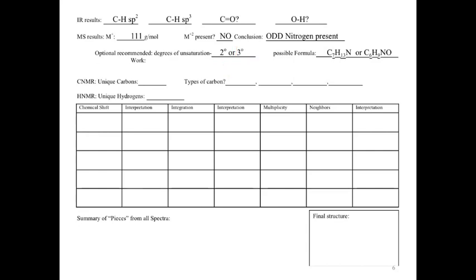So hopefully we're still following along. You'll notice we're 19 minutes into this and this is it being explained rather quickly. So realize that a complete solve will take a decent amount of time. The next part about this is moving into our carbon NMR.